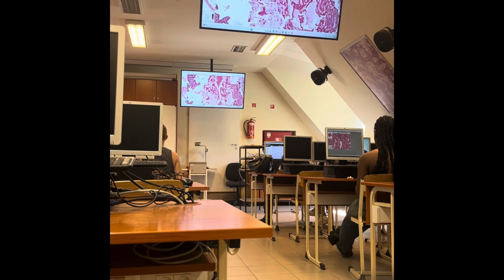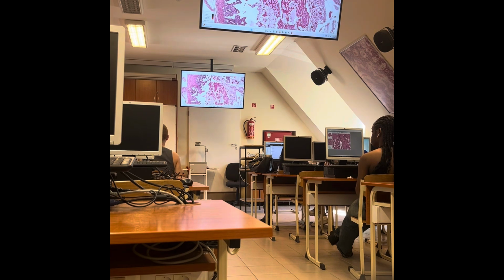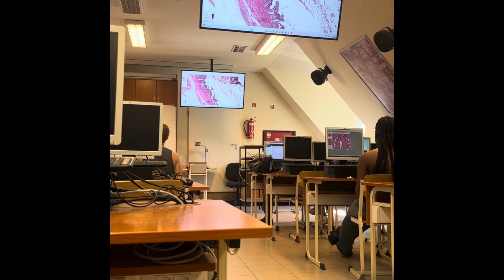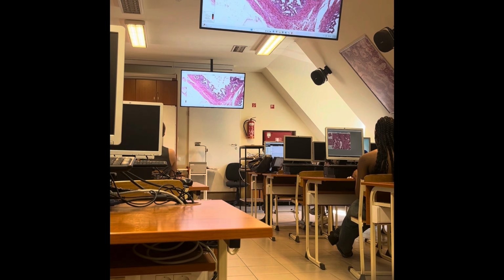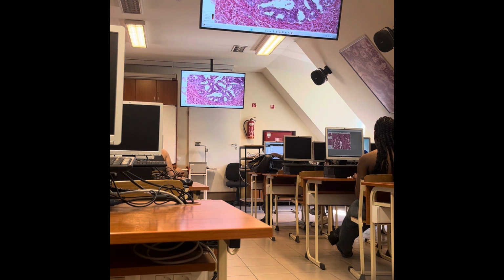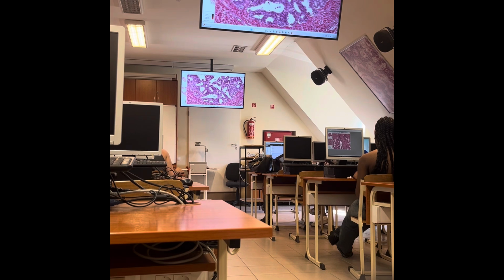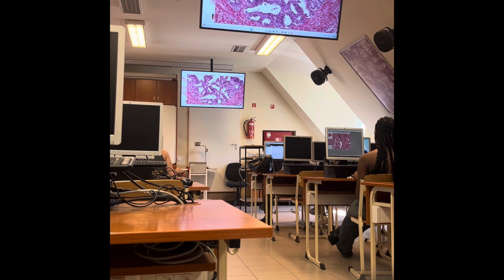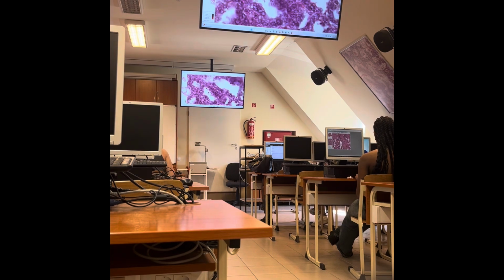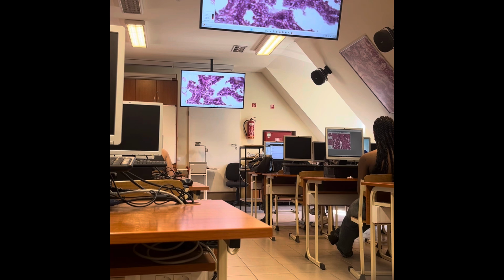Some of the epithelial cells are shed into the lumen of the seminal vesicle, and that is what you can see there. So the mucosal membrane has the same appearance, a labyrinthine picture, and the lamina propria layer is covered by a variable type of epithelial cells.